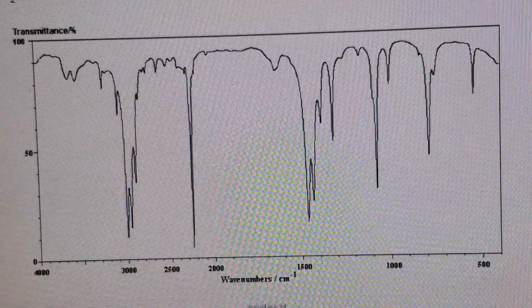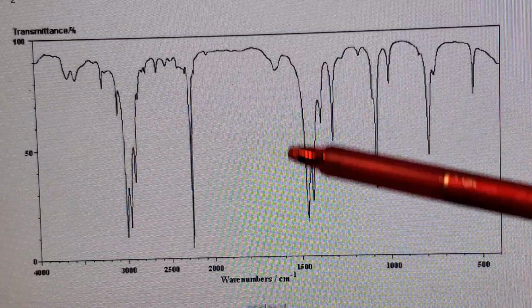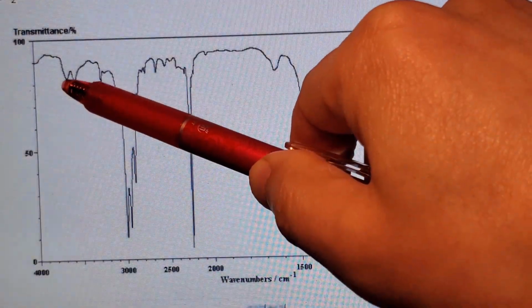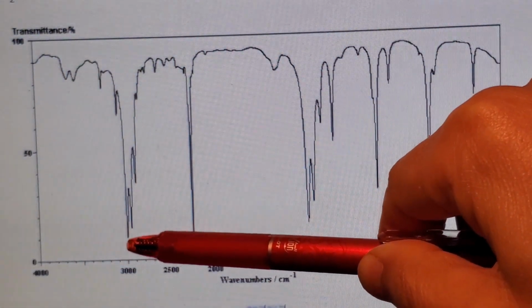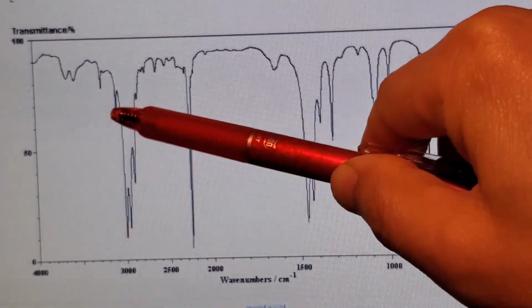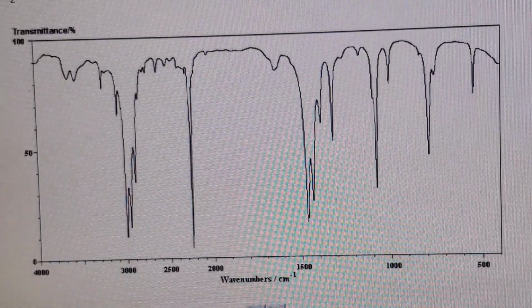So this is a practical lesson. You have to ignore this intense signal and those NH2 looking signals, and this number is awfully close to being alkene or alkyne CH, and these are as well there, unless you have other evidence.